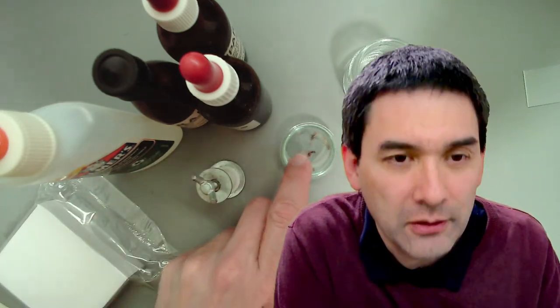Okay, so good. I want to give you a little bit of context here of what I'll be doing today. I've got a few specimens here, and if you've seen the picture in the thumbnail, that's indeed the varroa mite. Mites are related to the spiders. They're actually not insects. And the varroa mite is a parasite of bees, those little insects that make honey.